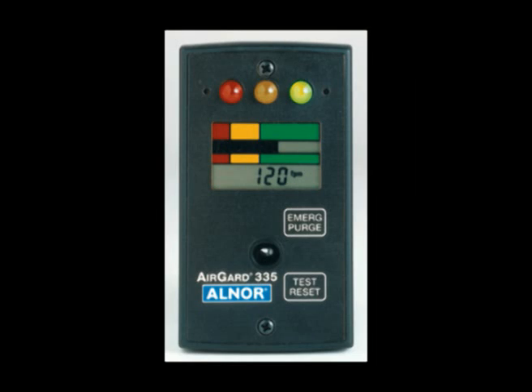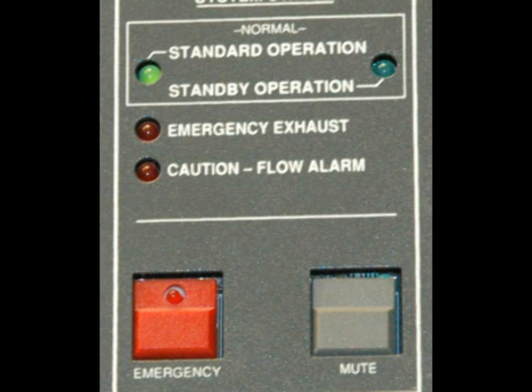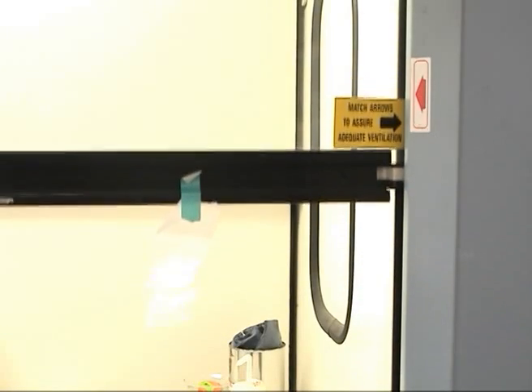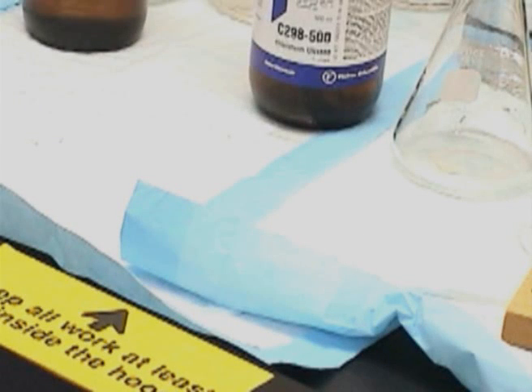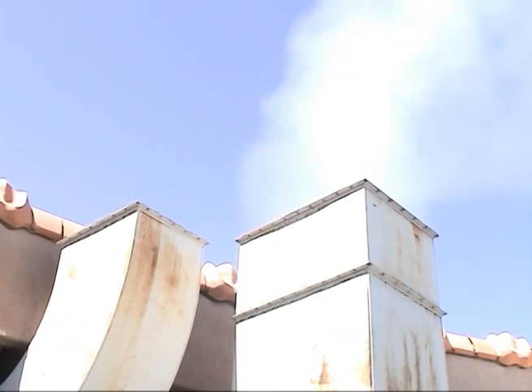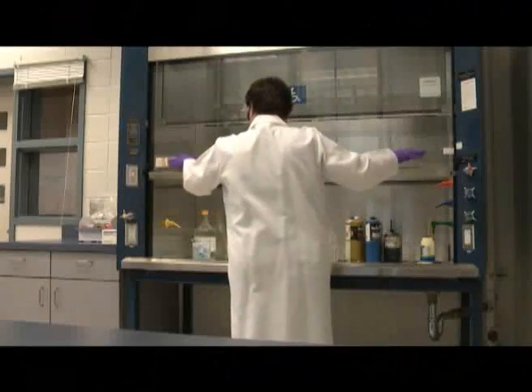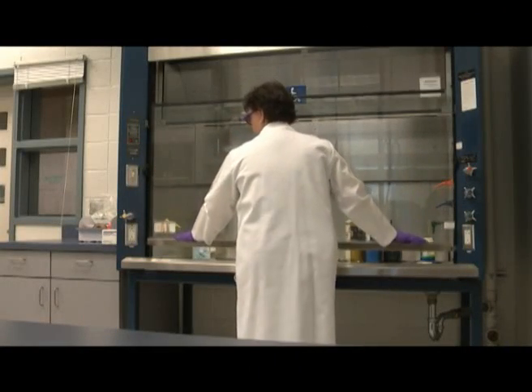In review, before using the hood, check the airflow monitor. Properly adjust the sash height for your work. Always work at least 6 inches from the front of the hood. Fume hoods exhaust into the environment. Minimize your fume hood emissions. Close the sash when you are done working in the hood.